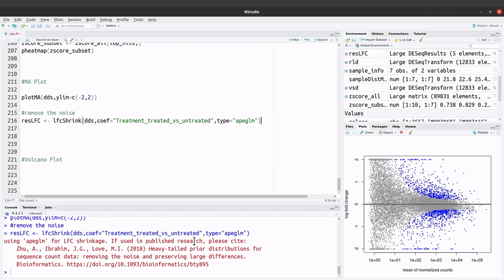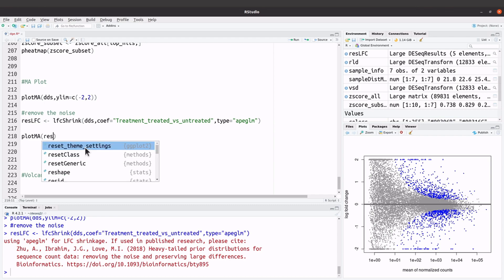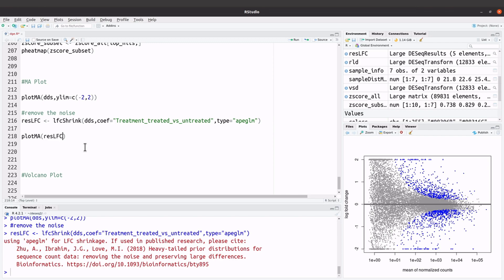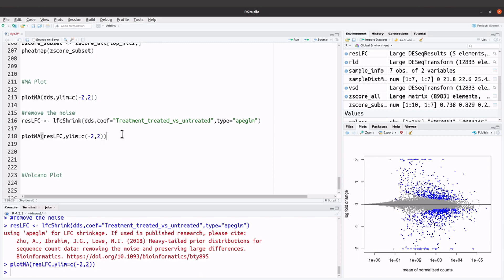Now we have removed the noise, so we are going to generate the MA plot. We say plotMA, and this time instead of using the DESeq2 object dds, we are going to use the one with the noise removed, which is resLFC, and then ylim equals negative two and two. Let's execute this command. You will see a new plot, and you will notice that the noise has been removed — now we have a good looking MA plot.